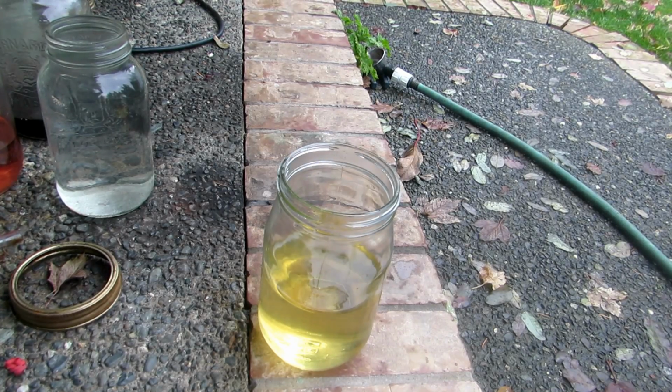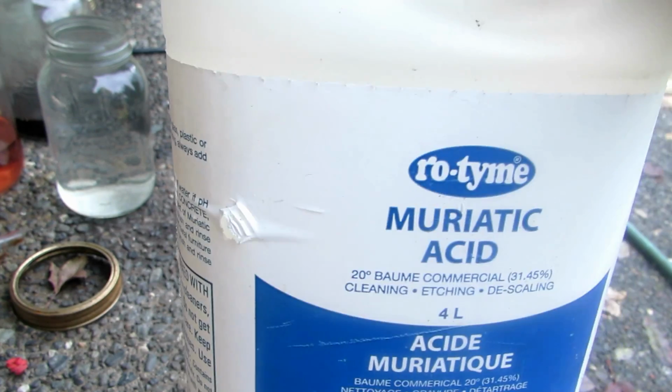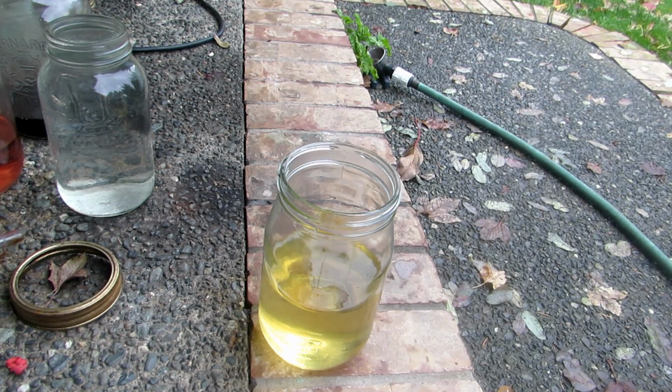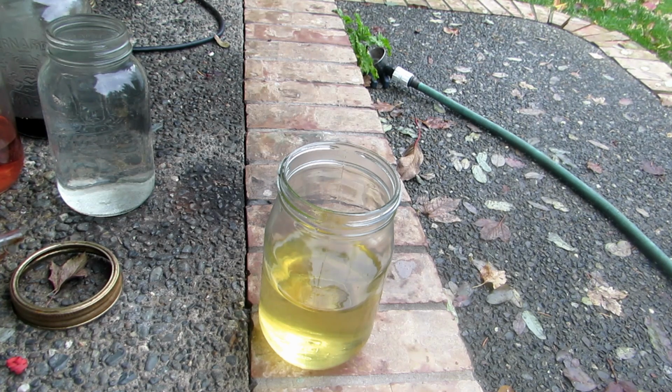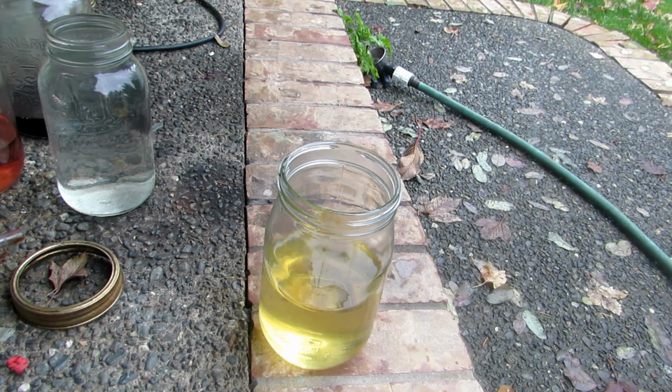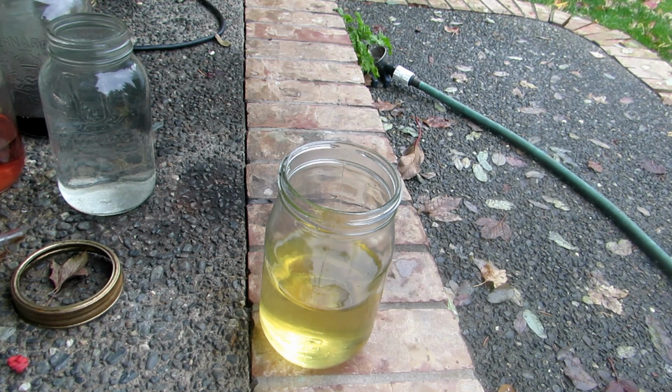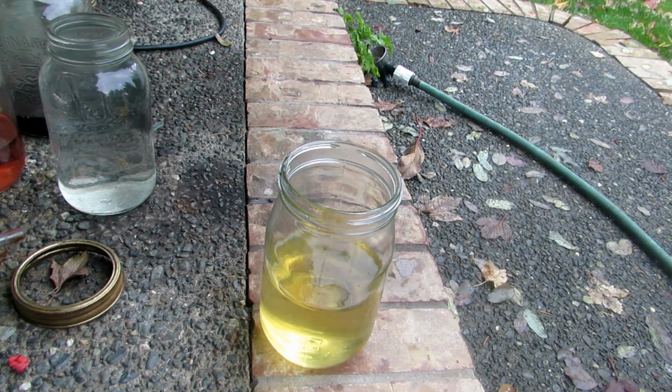Okay, so we're outside now, and here's the hydrochloric acid. Just muriatic acid, you can buy this at Home Depot, and it's really good. I'm almost out though, so I should buy more. Now, it is important to note that if there is excess sodium hydroxide in solution, the neutralization of the sodium hydroxide will be a very exothermic reaction. This will heat up significantly. This is why we cooled our solution down. It is at room temperature currently.